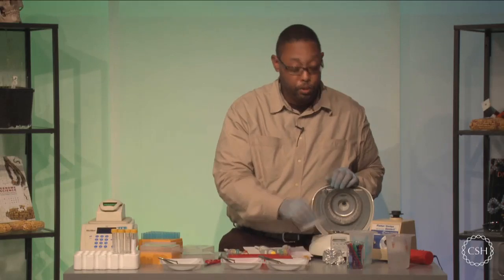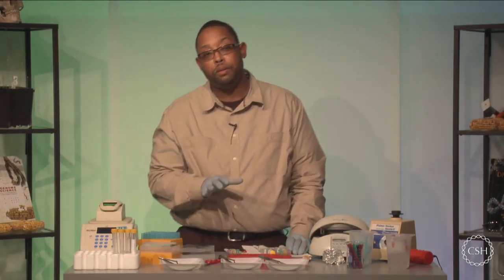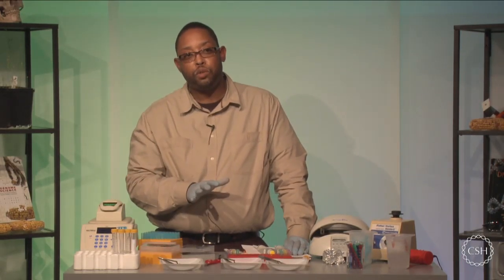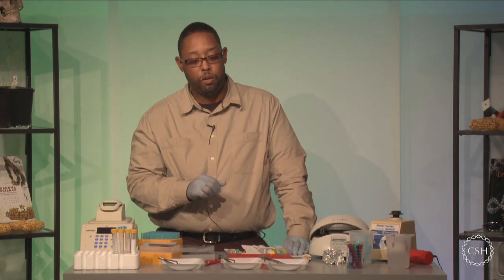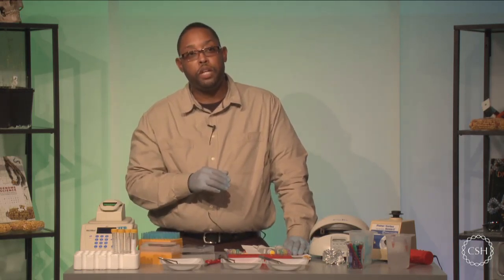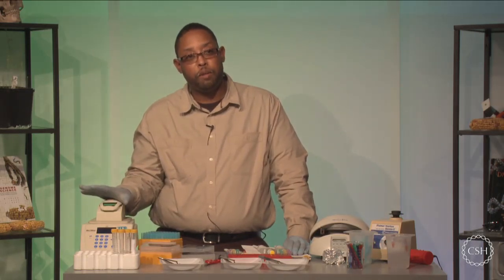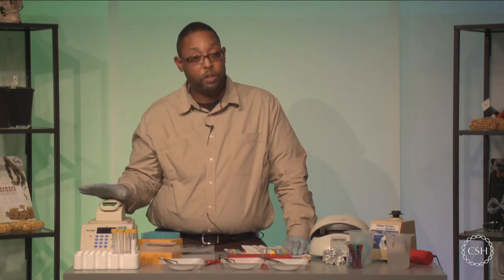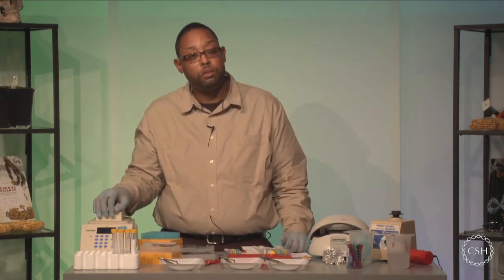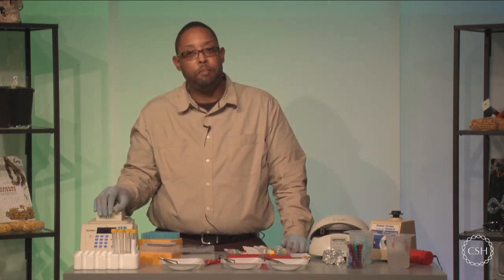That essentially concludes the silica DNA isolation, in which you have your DNA now soluble in water. Okay? You can freeze this down at -20, and it will stay stable relatively long, but I do recommend with fresh samples going straight to the PCR amplification so that you can get your PCR product, confirm it on a gel or some other matrix, and then move on to sequencing after confirmation of a PCR product. But this actually concludes the silica DNA isolation, and if you have any questions, I'll happily field them at this time.